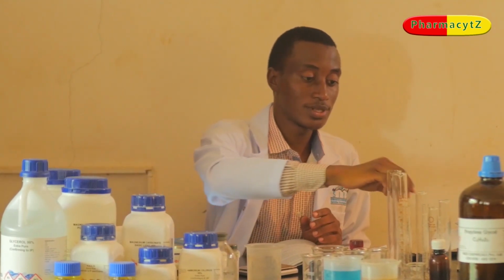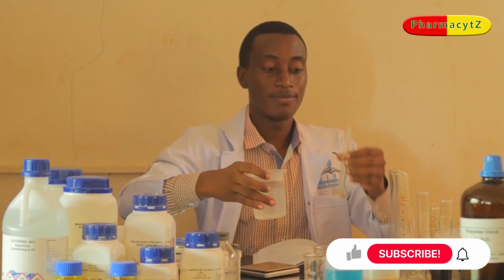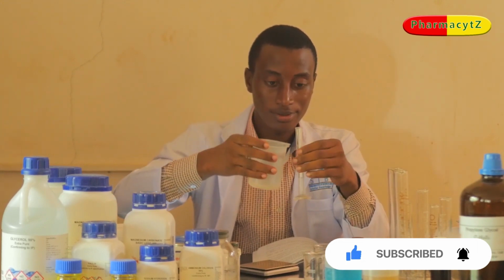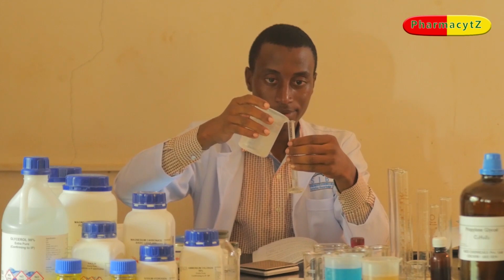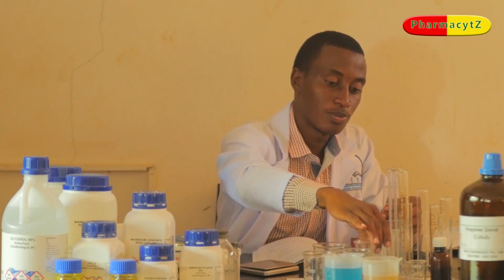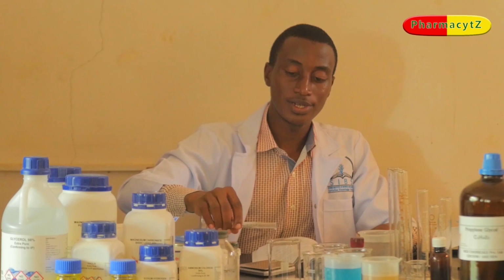in 2 mL. Now, using the appropriate measuring cylinder, I have the 10 mL calibrated measuring cylinder, so I'm going to measure 2 mL. And these are 2 mL of purified water. Then drop these 2 mL in the measuring cylinder.